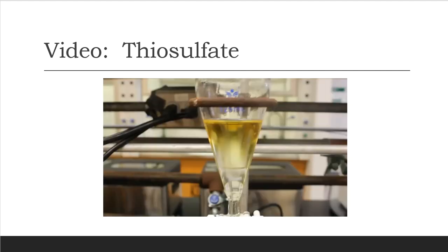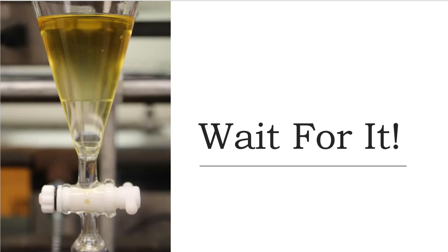Okay, so that was the story with the separatory funnel. And I'm going to say, wait for it, right? So in the lab procedure, it actually will tell you, add the thiosulfate to remove most of the color. And it looks like they were telling me the truth. Go figure. A textbook telling me the truth? Now that's a whole bite to chew, isn't it?